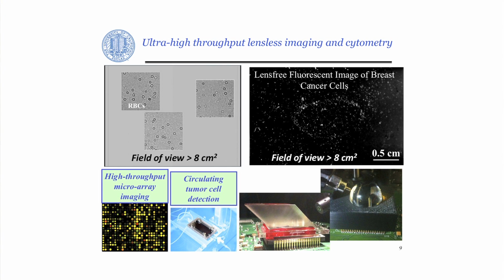I won't go into this as much, but when I talk about the platform being independent of the imager, CCD versus CMOS, I'll come back to this point because the variations between CMOS and CCD imagers give us unique opportunities to actually practice different kinds of fields of view and resolution combinations. Let's come back to the principle of lens-free imaging. How can you, without the use of any lenses, see things that are very small, smaller than a micron, a few hundred nanometers, at the scale of a single virus even?